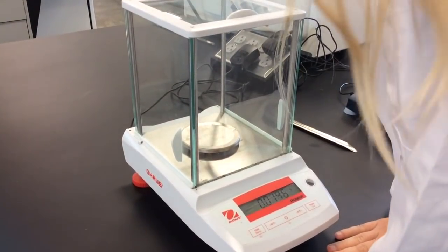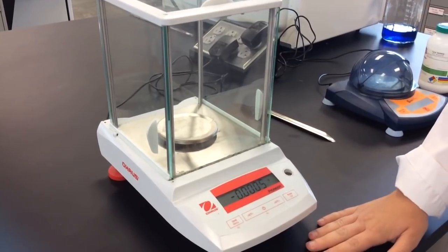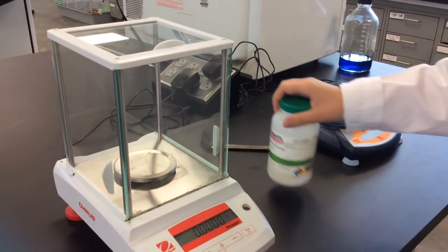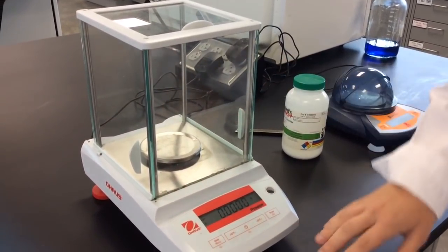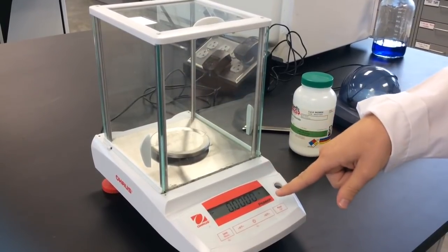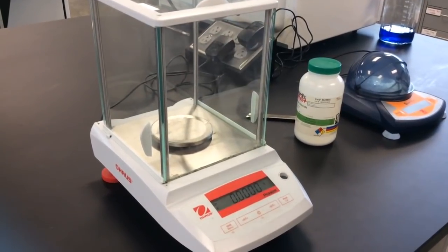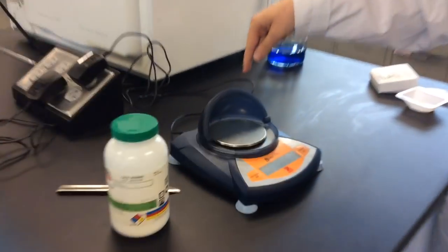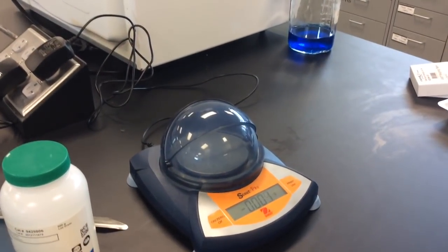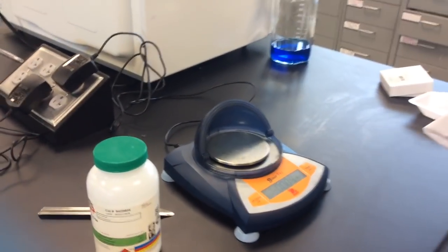If you press on the table, the reading also fluctuates. So when you are weighing out something — for example, salt — you want to make sure the doors are closed and you are not leaning on the table, because that will make the measurement totally off. Same thing with the tabletop balance — keep it closed when measuring if you can. If something is too big, that's okay.